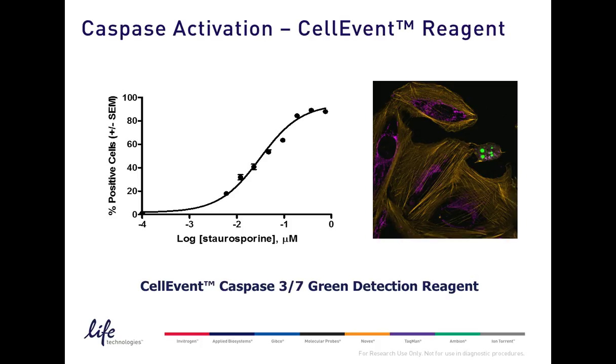But this also works as a purely fluorogenic sensor. The data here is from a high-content imaging platform. It does work for flow, which I'll show in a moment, as well as plate readers and traditional imaging. And indeed, on the right here, we've got a population which is treated with low-dose staurosporine for 4 hours, about 0.5 micromolar.